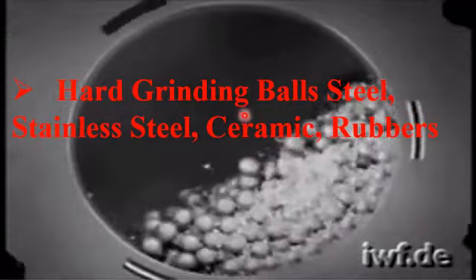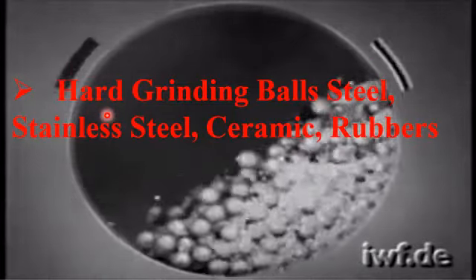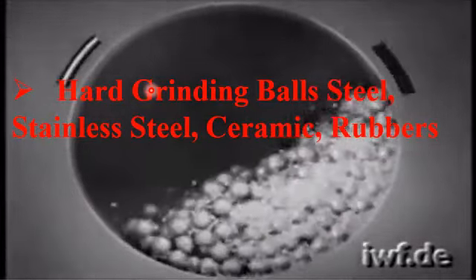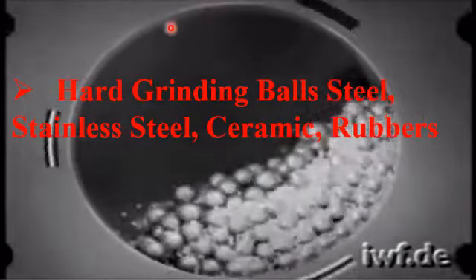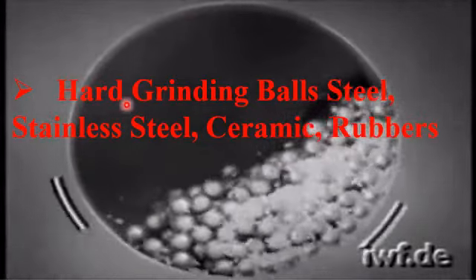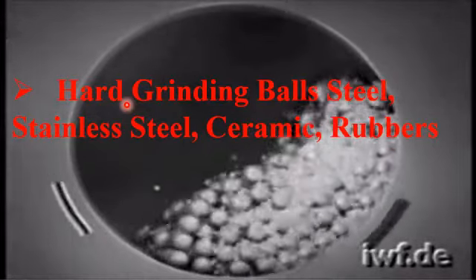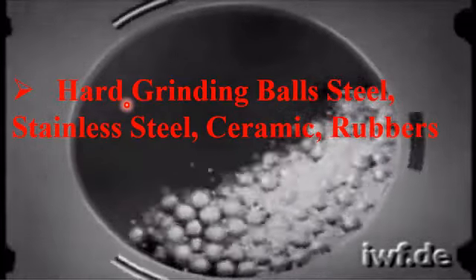However, in the case of large to medium balls, they move freely inside the ball mill hollow drum and crush the bulk material into nanoparticles. But in the case of small grinding balls, they are kept with a pulley and belt setup, which causes the rotation of the balls, and with that they crush the bulk material and convert it into a nanomaterial.